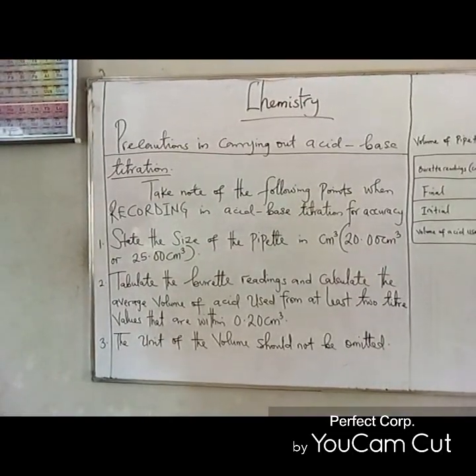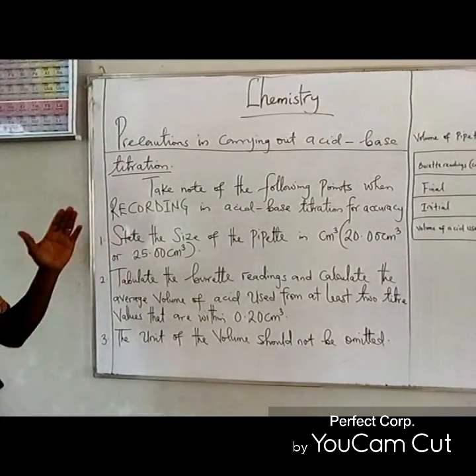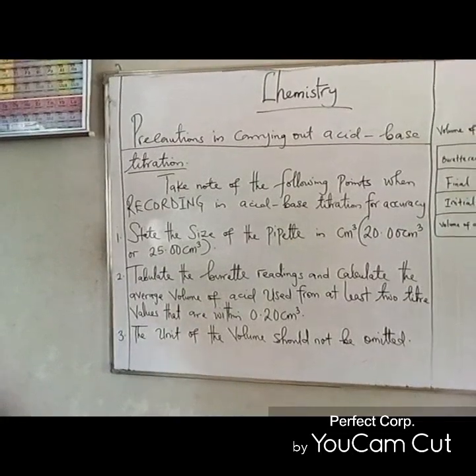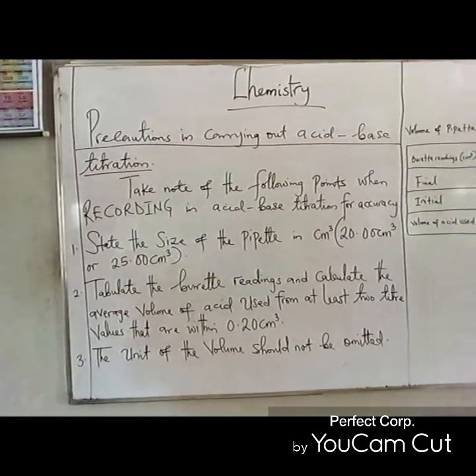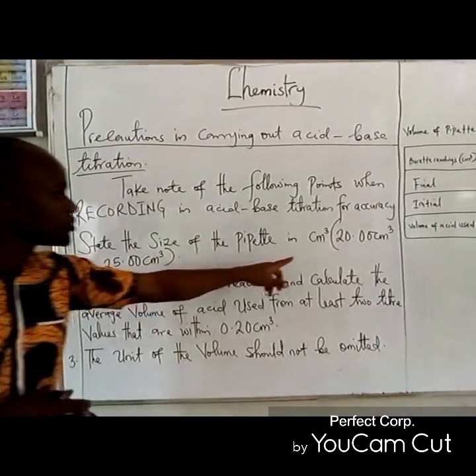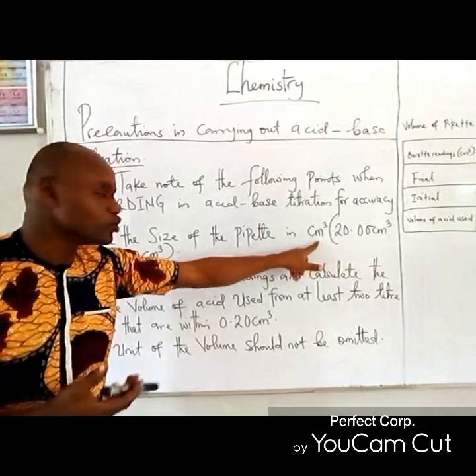The first one we have here is: state the size of the pipette. And if you take note too, you are seeing the unit of the volume there.